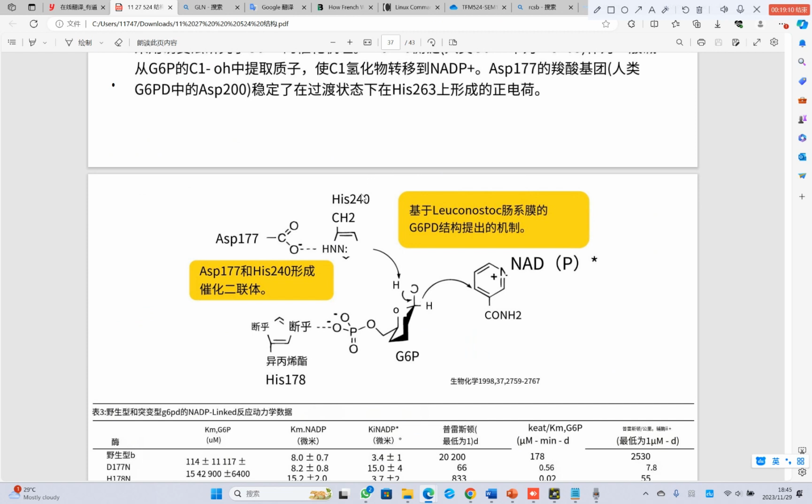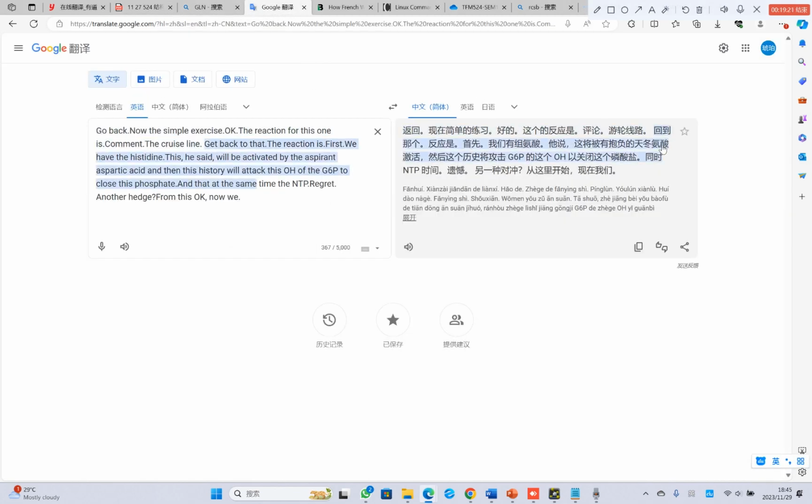Two minutes. Can you find it? You want to ask anyone? No cheating. Done. Can you find this? Which one? Remember, your histidine must be green, not pink. So, which part are you talking about? This one is which part?